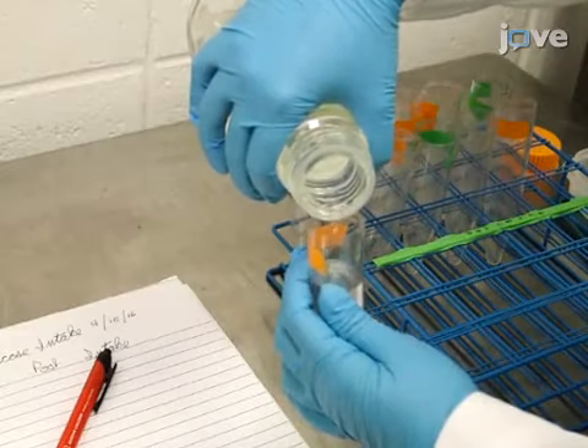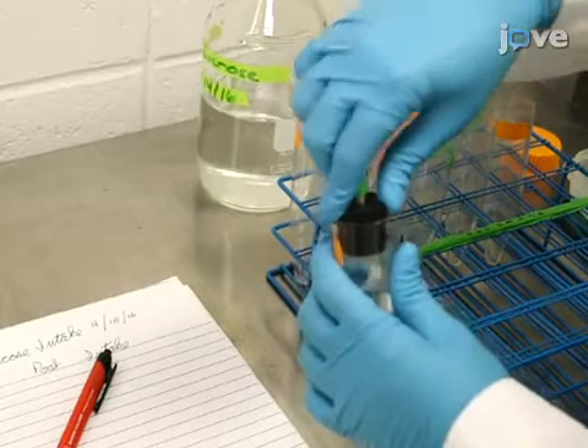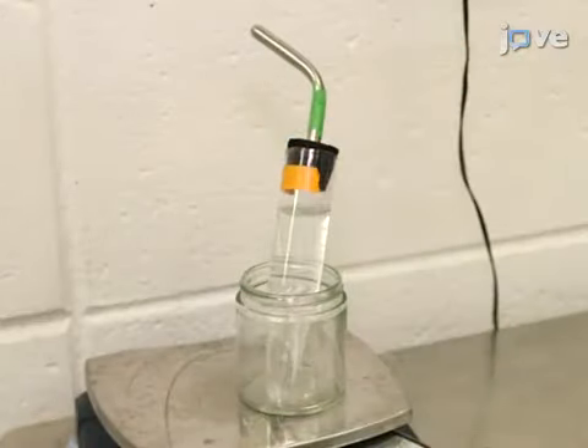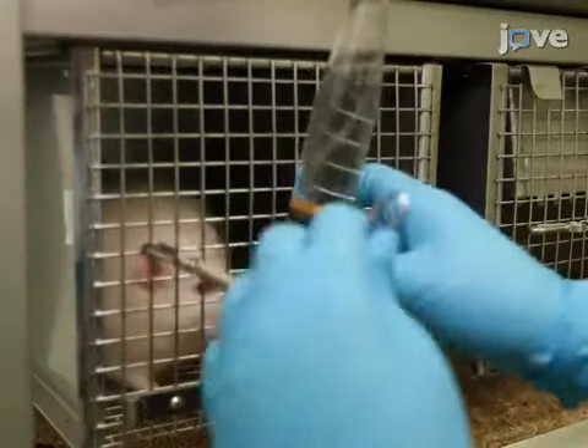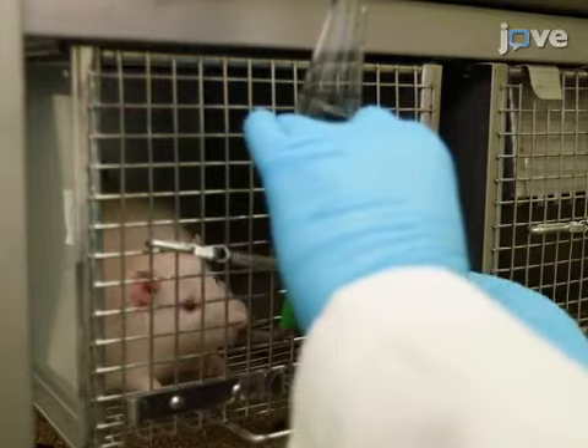To set up the apparatus, use a calibrated centrifuge tube with a rubber stopper and a 45-degree angle metal sipper tube to provide an accurate measurement of the solution presented to the rat. Secure it to the home cage by a taut metal spring to allow visibility of the calibration.